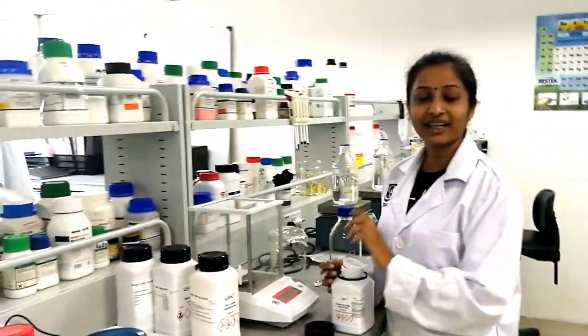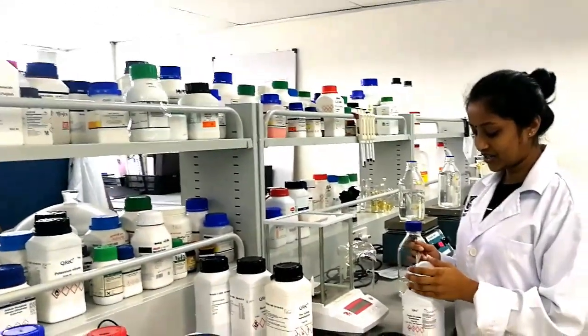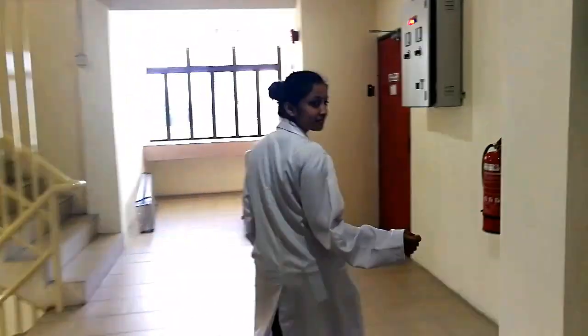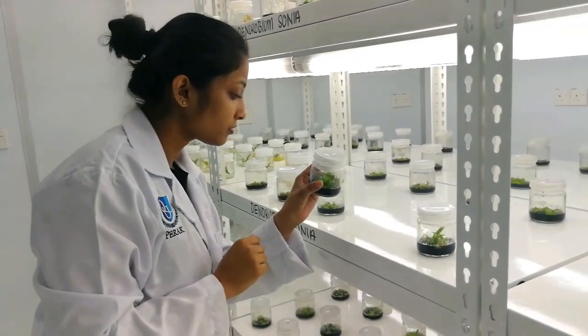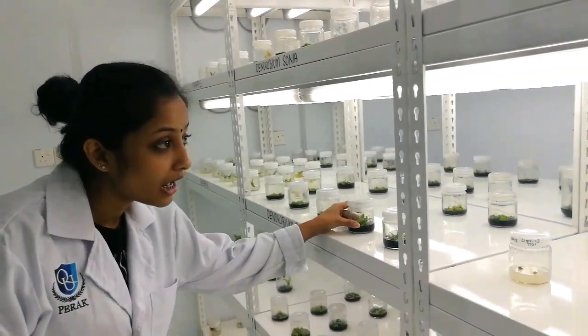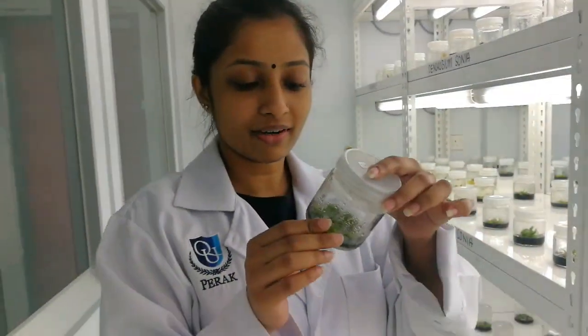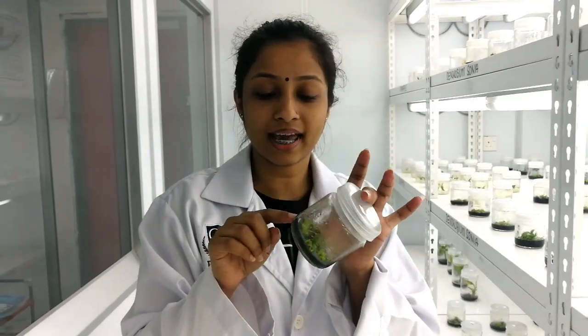And I will be culturing it in plant tissue culture that we have over there. So this is where we will grow our plants. This is my final year project of the day, this is a callus.